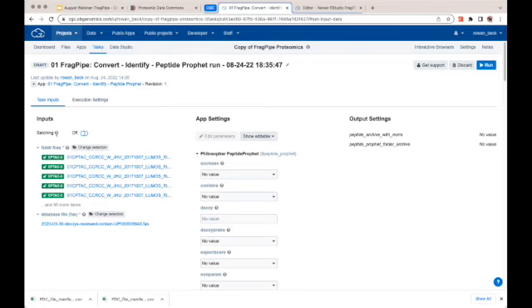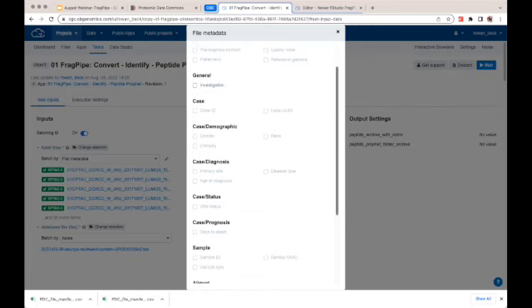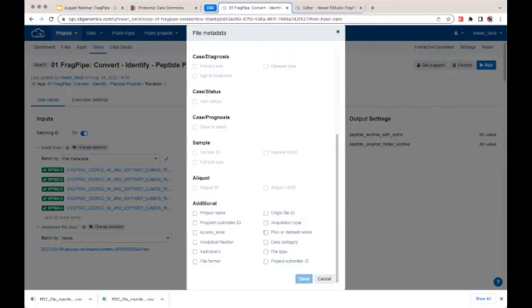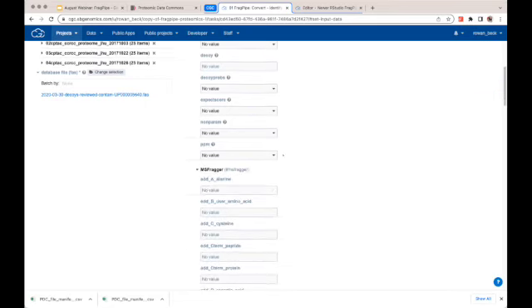What we're going to do actually is batch these files. So what that means is running them simultaneously. And we're going to batch by the metadata of the files. So if you'll scroll down, you can click on plex or dataset name. So that divides all the files by experiment type, and it just runs faster. So again, keep everything else pretty much default.